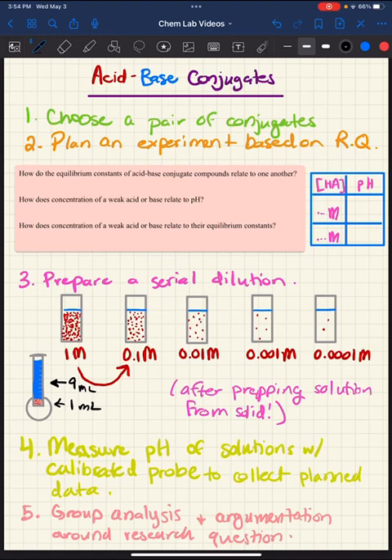And you would do this process repeatedly, being careful that you wash out the equipment you're using to do the serial dilution, because as you get to a lower and lower concentration, any residue will actually throw off your concentration significantly. So it's important to make sure you're using clean, rinsed out equipment for each serial dilution step. All right, so that's just an example, but you'll have to think about how many milliliters you will actually need of each solution to conduct your experiment before actually calculating and doing your dilutions.